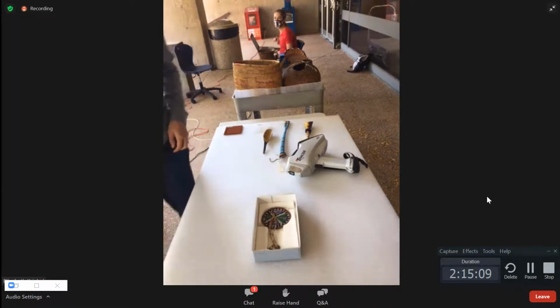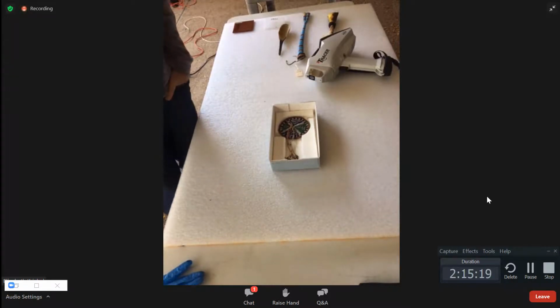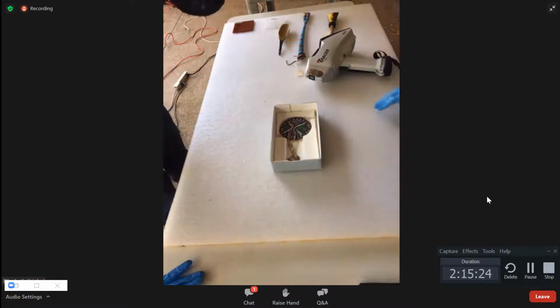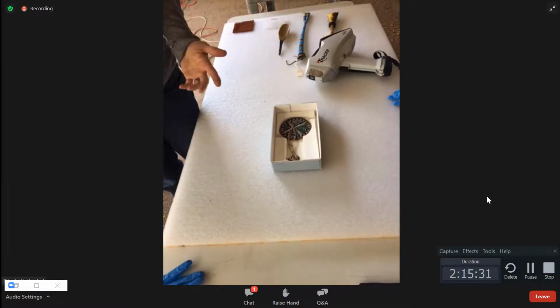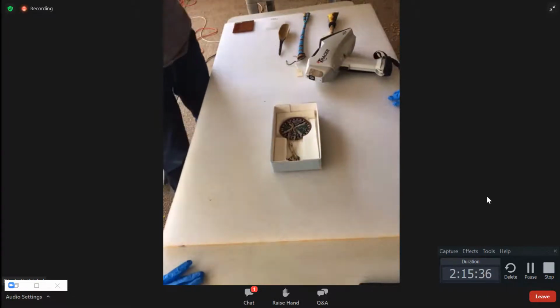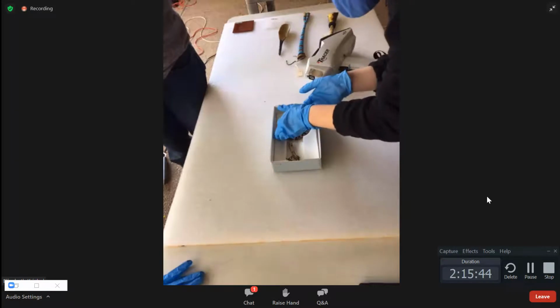All right, so what we have here looks like a dream catcher to me, kind of. I don't know if it is for effect or not. We've got a lot of glass beads. The glass beads are obviously not going to have any preservative, and like we've seen before, it's going to be lead and arsenic with a coloring agent. So what we want to measure is the outer ring, if we can. I don't know the easiest way to do that, because if we get any of these beads in this measurement, we're just going to be measuring the beads.